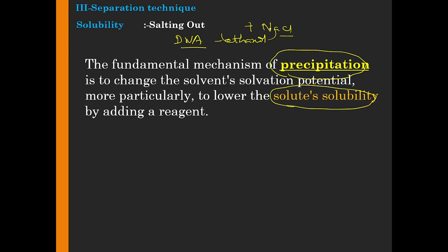We are doing it because of the solubility; this is a polar molecule, and when you use this, it takes out the charges from the DNA because it's more polar as compared to the DNA. And second, when you add the ethanol, the DNA is not actually miscible, or you can say it cannot dissolve. Whatever residual water there is gets taken up by this ethanol, the DNA is not miscible, and then you precipitate it out.